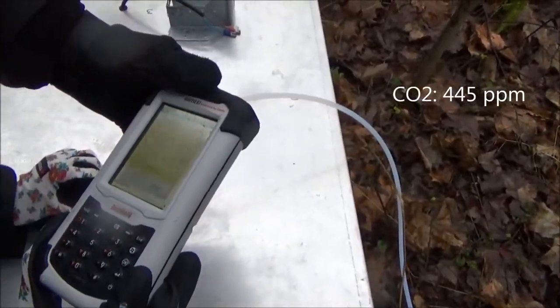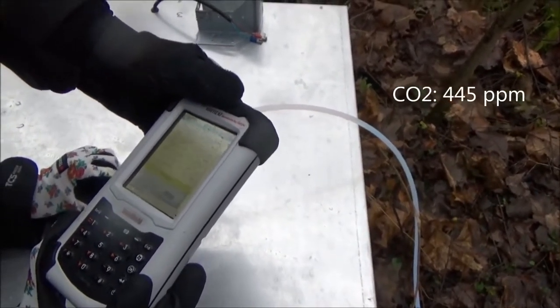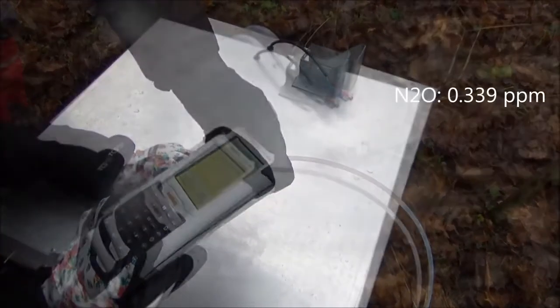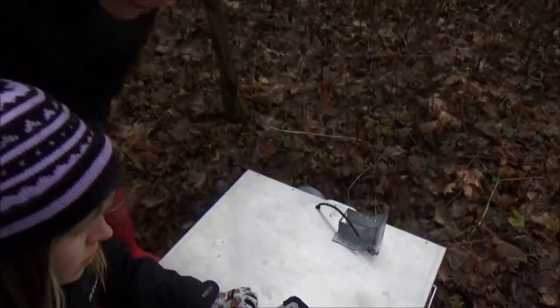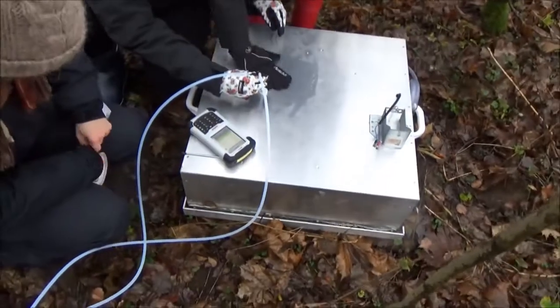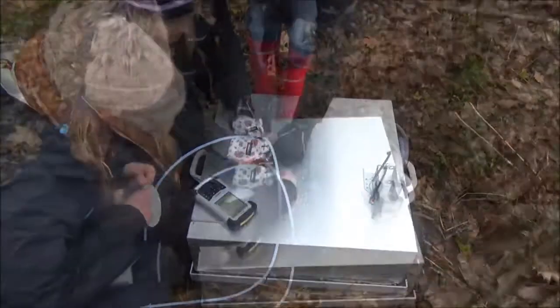We have a starting concentration of 445 CO2, methane 1.25, and nitrous oxide 0.339. I expect that we should wait maybe 15 minutes to see any changes. In order to stabilize the conditions inside the chamber and guarantee representative sampling, the opening was sealed with duct tape to prevent any leakage air coming in.